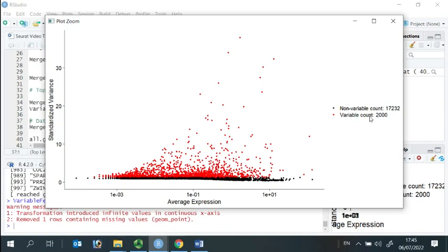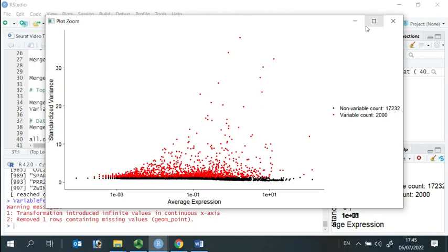In total, in our object, we have 19,233 genes.